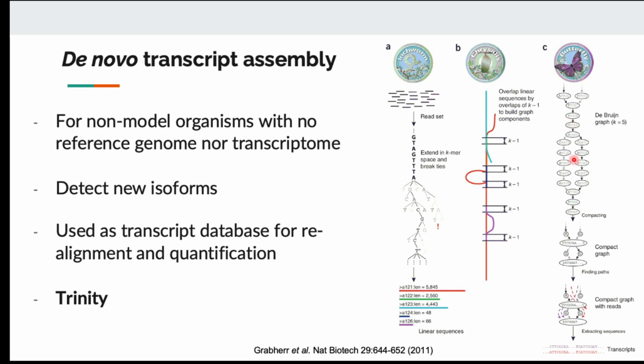But the final target is no longer a chromosome, it's going to be just one isoform. So hopefully we can map all the reads, connect them together, so that we reconstruct the whole gene isoform. And when there are multiple splicing possibilities, that means we have multiple paths in the graph. So this might be isoform 1, and this might be isoform 2. It's the same concept as DNA assembly. So there's nothing new here.